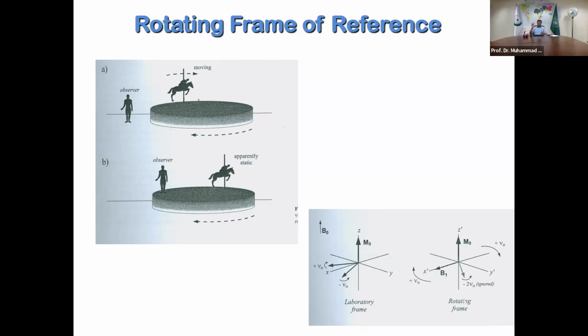Then you give a second pulse, and so many experiments, thousands of NMR experiments, have a second pulse, third pulse, fourth pulse, fifth pulse, and literally hundreds of pulses. The one single pulse, which you have seen in a simple proton NMR or simple coupled C13 NMR experiment, is the easiest thing.